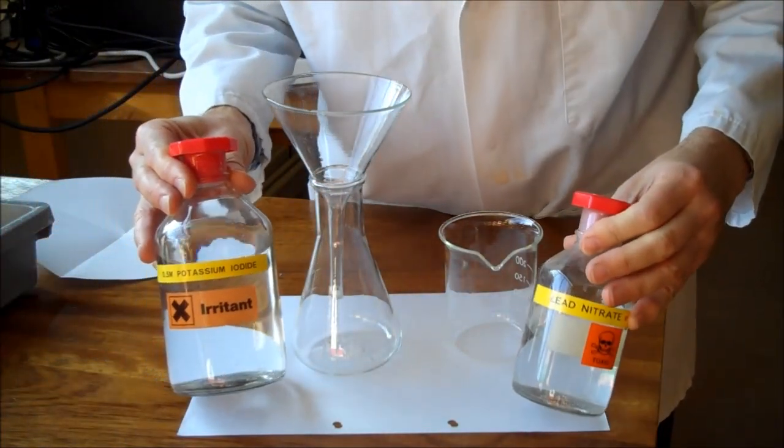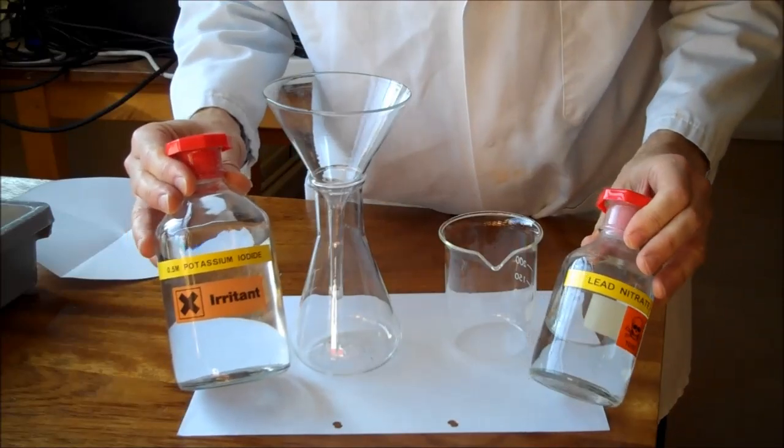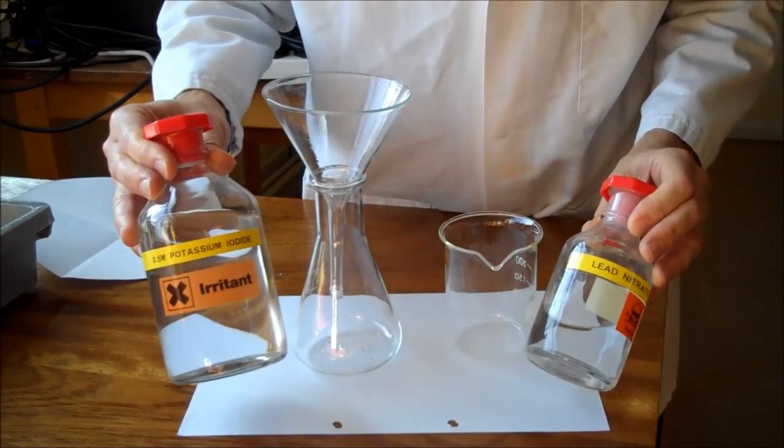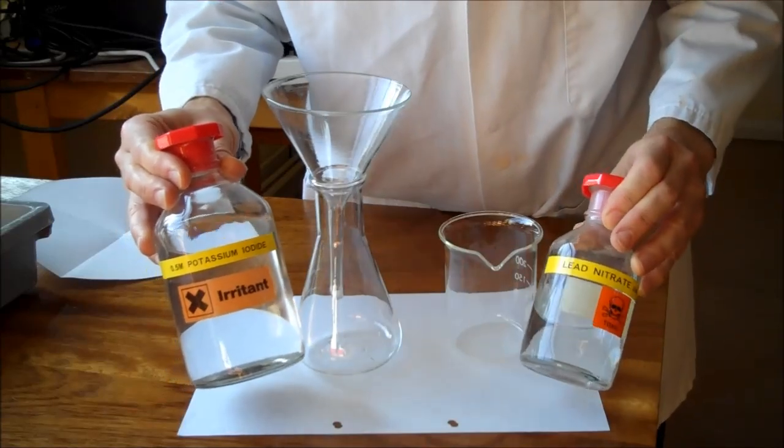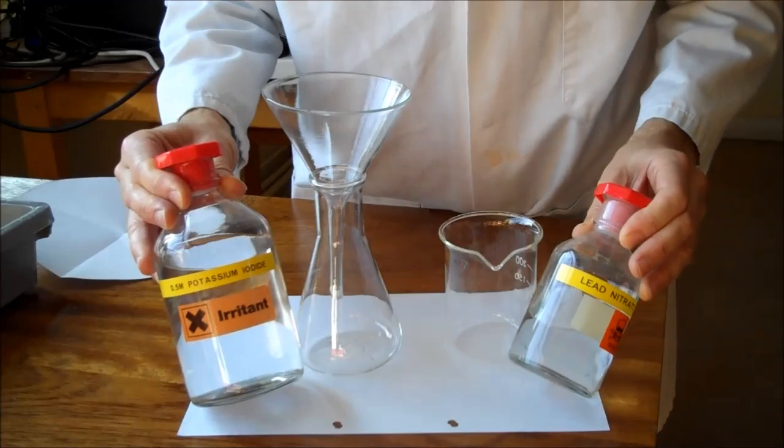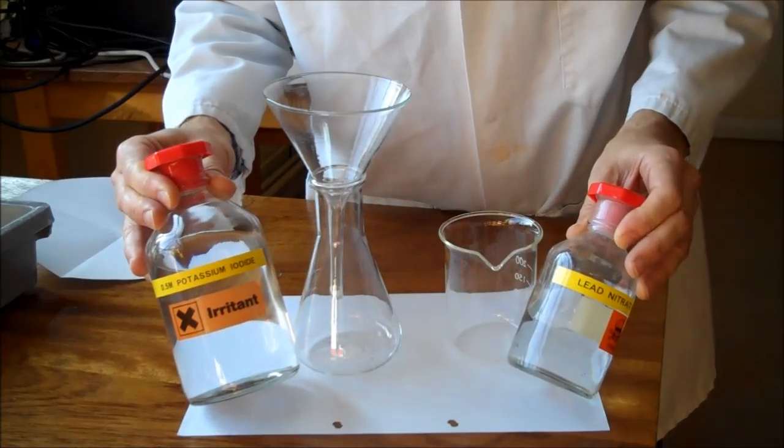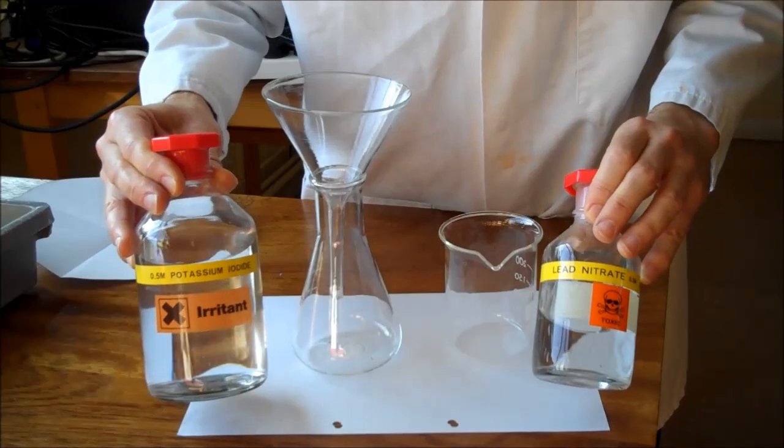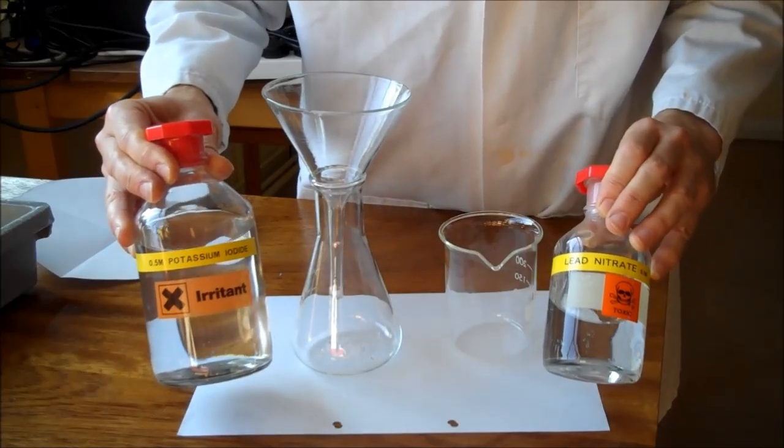Here I have two solutions. We can tell the chemical is fully dissolved because the solutions are clear. In this case they also happen to be colorless, but the two words don't mean the same thing. For example, copper sulfate solution is clear - you can see through it - but it's blue. In these two instances they're both clear and colorless. A solution must be clear.